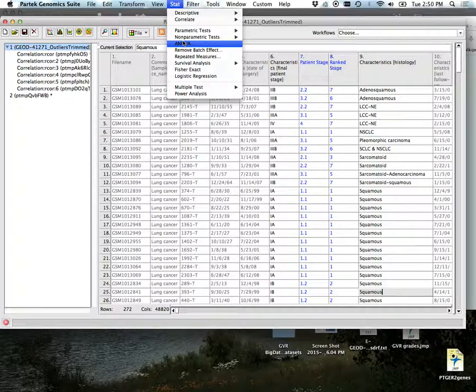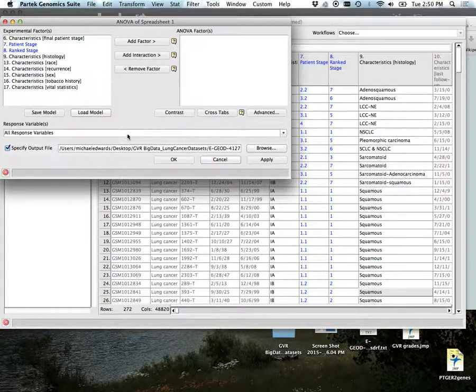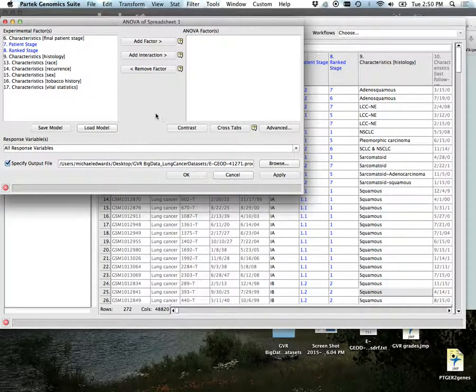Basically what this is doing is measuring groups of things and determining whether the distribution around the mean is the same. If it's different, then it's probably a different group, and therefore you have a difference. Then you get a p-value. So we can hit ANOVA, and this is where you can test anything you want, guys. And this is really cool.